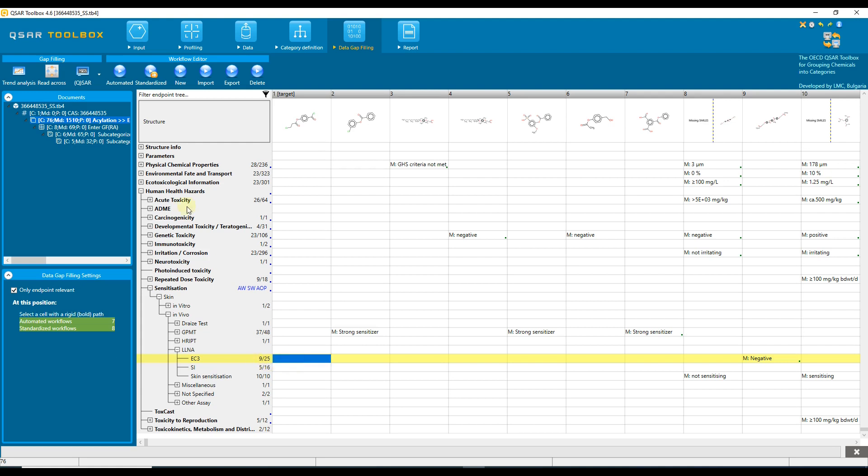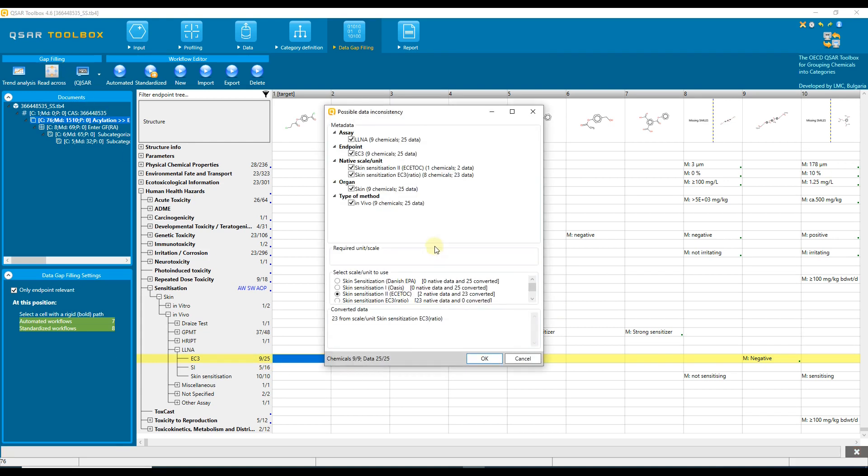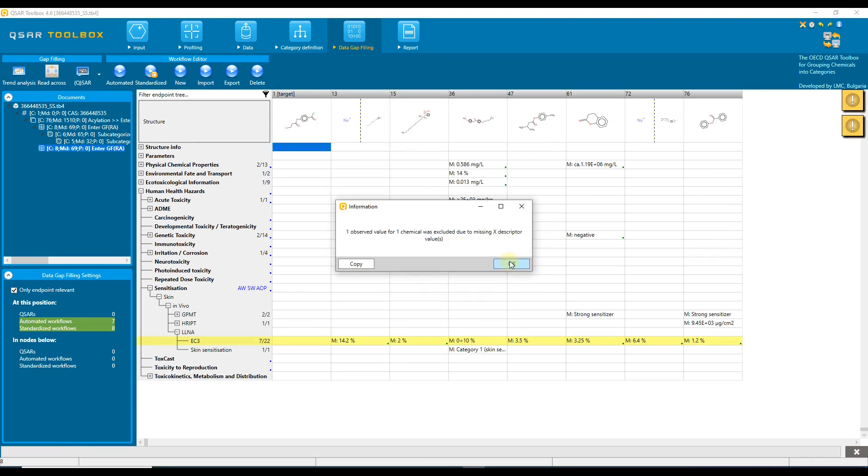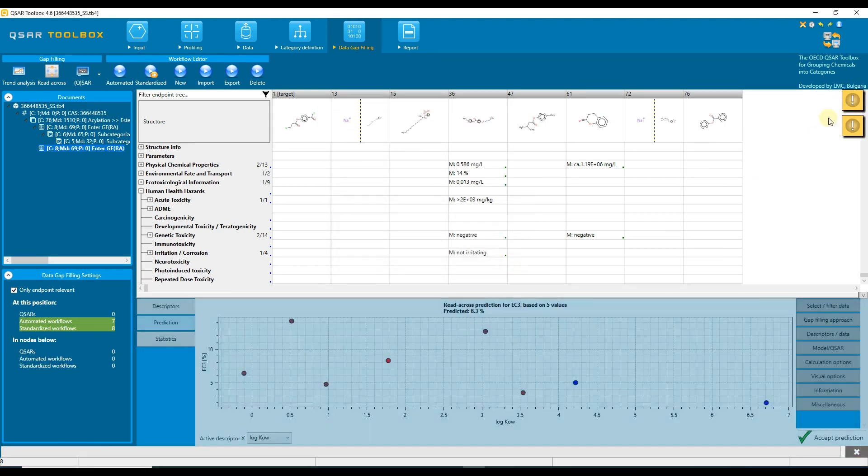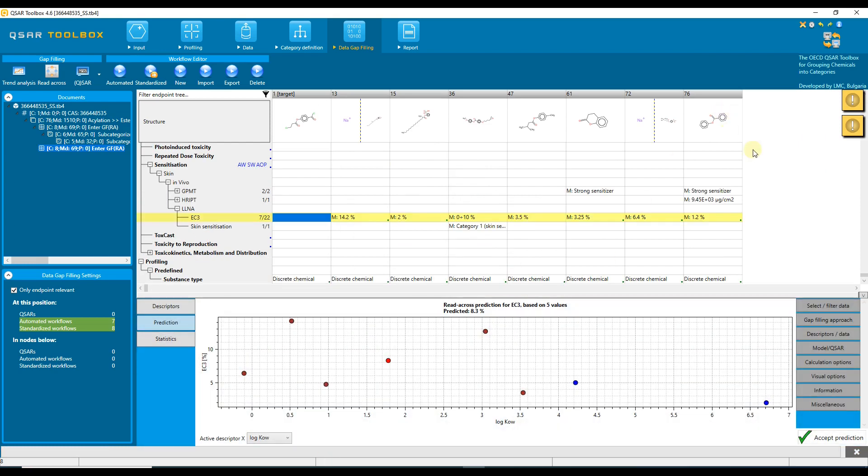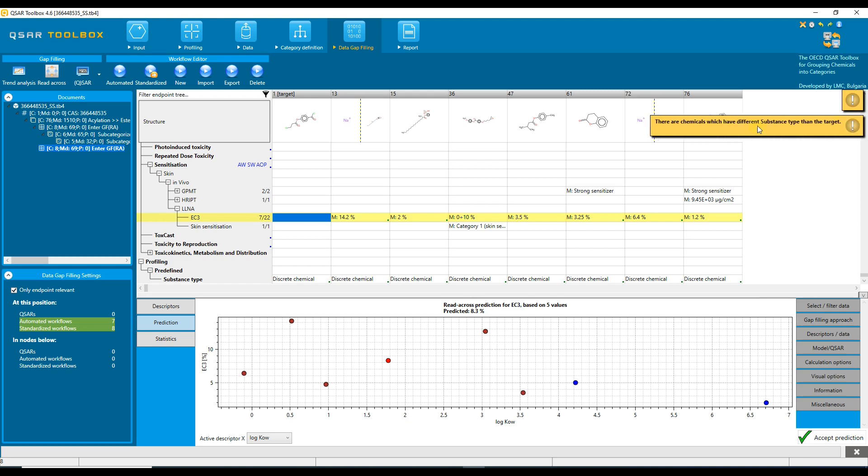Let us continue with read across. Change the scale to skin sensitization EC3 and confirm. For our information, we open the helpers. The first one says that there are data with qualifiers, and the second one informs that there are chemicals with different substance type.